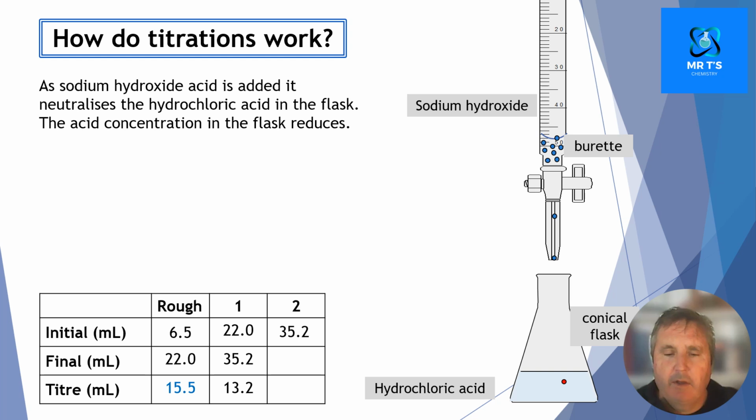Now at this part of the titration, of course, we're only going to add a drop at a time, because as soon as I add a drop, I'm going to add just a small amount of sodium hydroxide particles that will neutralize the last of the acid particle, and then add a very small excess of sodium hydroxide particles in the bottom. You can see that represented at the bottom.